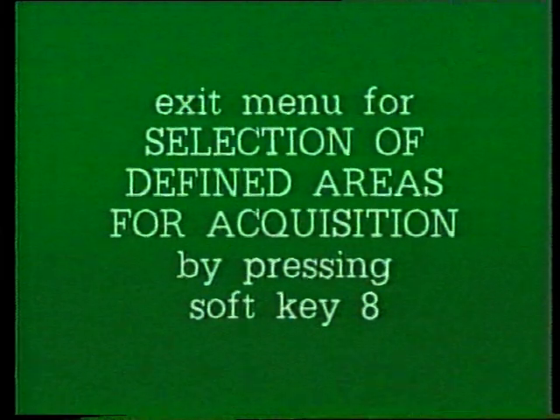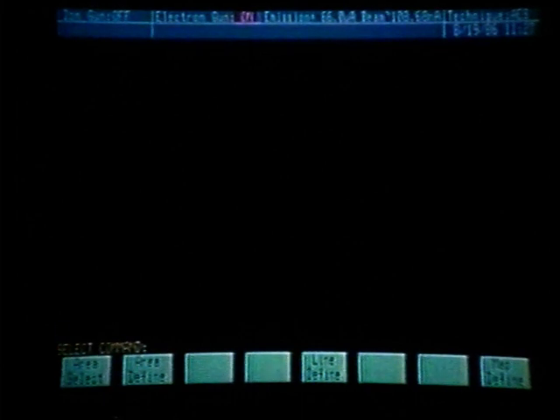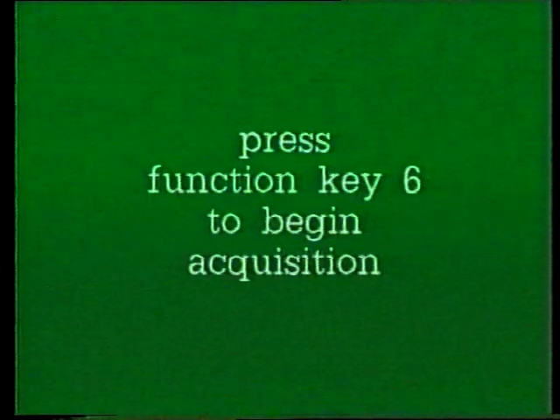By utilizing the TV and remembering the elements set up in multiplex mode, we can determine which areas to have on and off. Right now only area two is on, where we will see the tantalum, carbon, nitrogen, and oxygen. Once finished with setup using the TV and areas mode, we exit the menu by pressing soft key number eight. We are now ready to acquire data on area number two, multiplexing for carbon, nitrogen, oxygen, and tantalum. Since we have already set up the multiplex, we just press function key number six and the acquisition will begin.